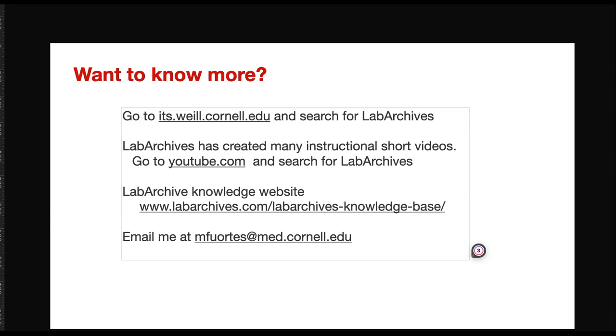So one of the benefits of RedCap is we're continually saving the data, backing up the data, enabling disaster recovery in the same way as LabArchives. And at the end of a research project, we can then work together to remove any sensitive elements that we might need to before we upload the data, say, to a public repository.